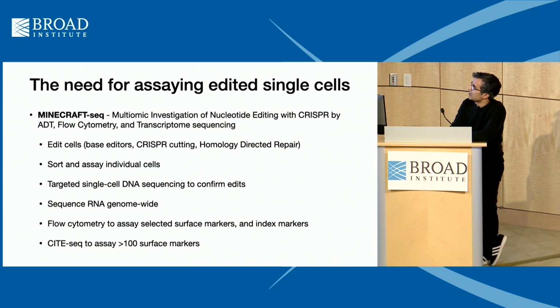That's what we went with. So we first edit the cells using something like a base editor or an alternative technology. We sort those individual cells into plates, and then we do targeted single-cell DNA sequencing where we're able to confirm the presence of the edit. And the real trick is we're also able to get RNA, genome-wide RNA data in those same cells. So getting both of those things to work together.